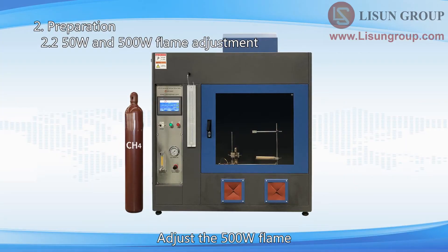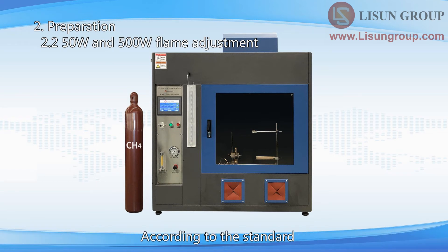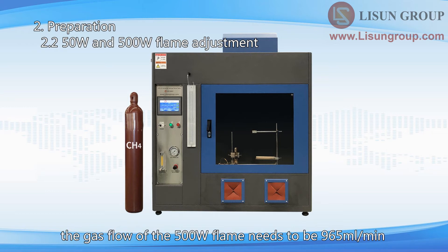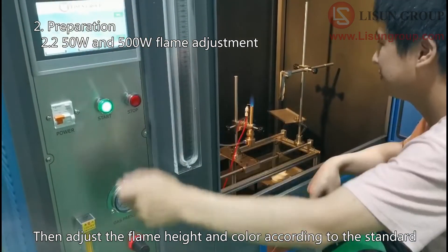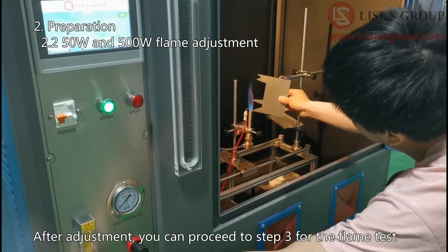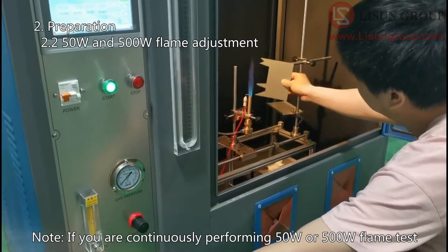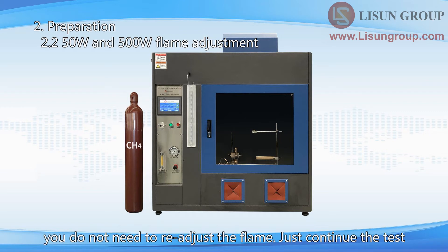Adjust the 500 Watt flame. The steps for adjusting the flow meter and the back pressure are the same. According to the standard, the gas flow of the 500 Watt flame needs to be 965 milliliters per minute, and the back pressure needs to be 125 millimeters. Then adjust the flame height and color according to the standard. After adjustment, you can proceed to step 3 for the flame test. Note: if you are continuously performing 50 Watt or 500 Watt flame tests, you do not need to readjust the flame. Just continue the test.